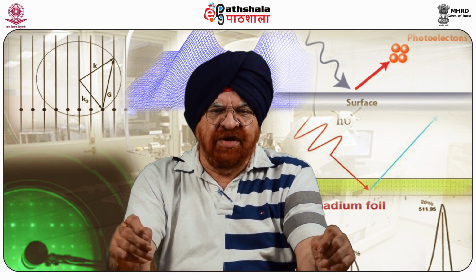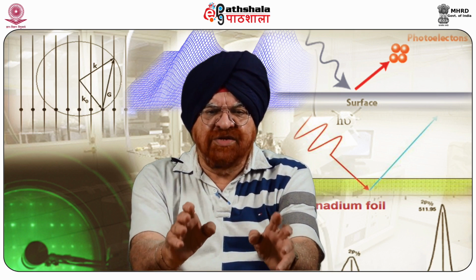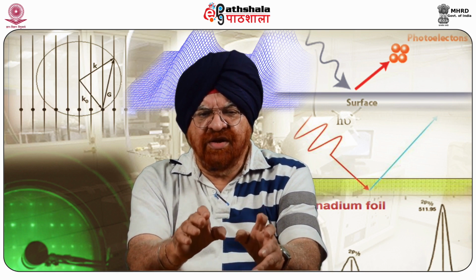When the core electron is ejected by the incident X-rays, the outermost electron fills the core hole. The energy of this transition is balanced by emission of an Auger electron, or characteristic X-rays. Characteristic X-ray analysis or Auger electrons, etc. can all be used in ESCA in addition to emitted photoelectrons.